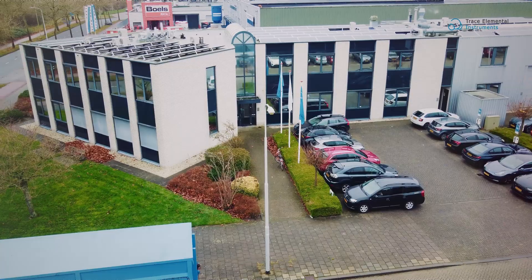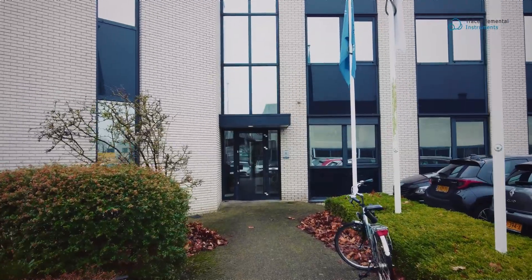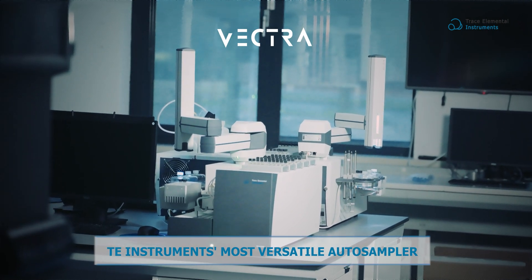In the dynamic landscape of modern laboratories, where demands and complexities are ever expanding, TE Instruments presents a transformative solution. Meet Vectra, TE Instruments' most versatile autosampler.